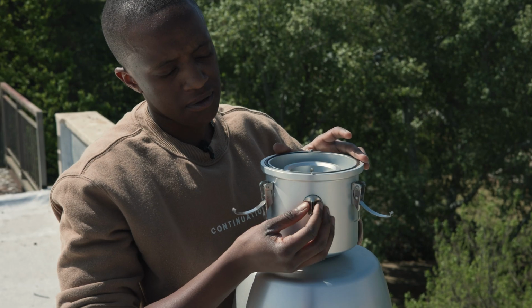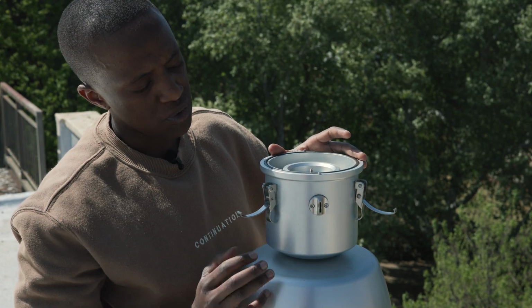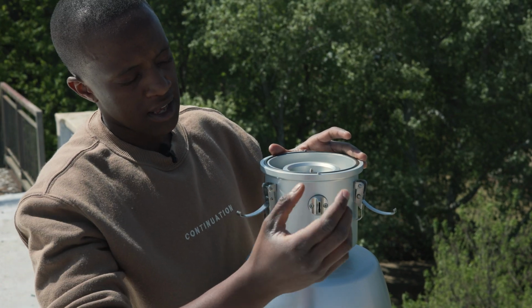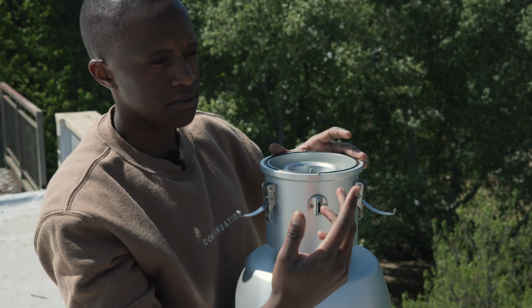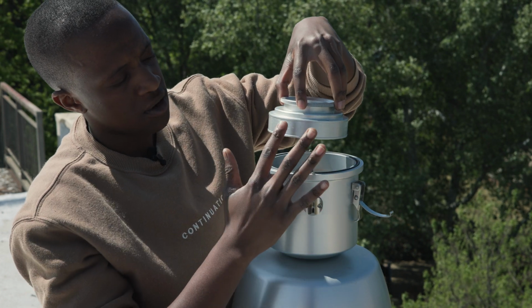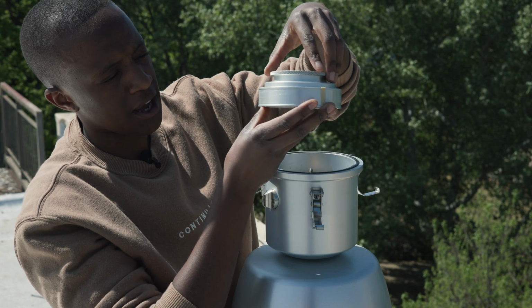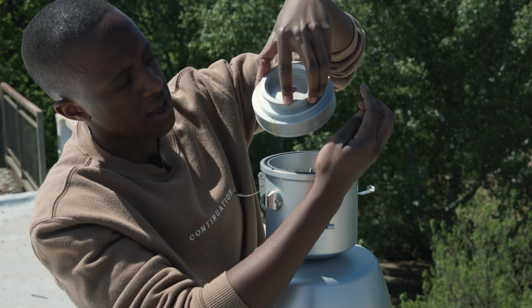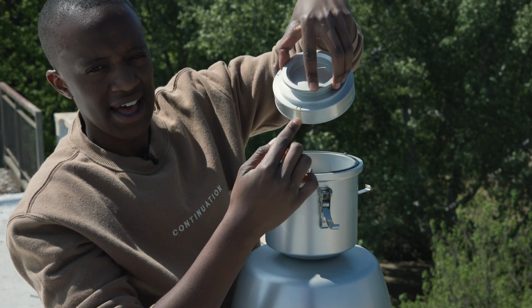So this nozzle is basically where the wind comes in. This machine works to suction in the air, allowing all the fungi in the atmosphere, all the spores in the atmosphere and the dust to come inside here and get trapped right along here. So it gently moves over time. So Monday all the way throughout the week to next week, Monday morning at this time.